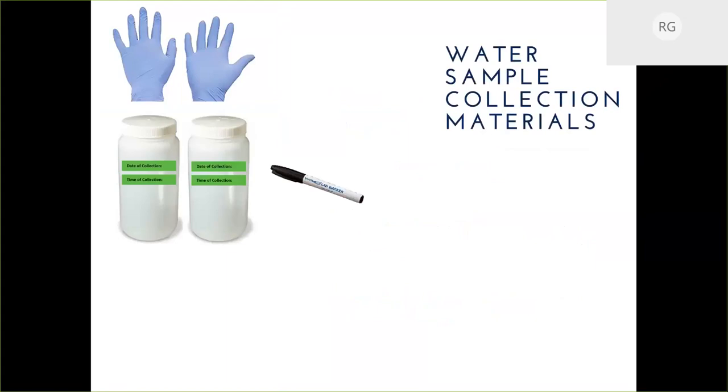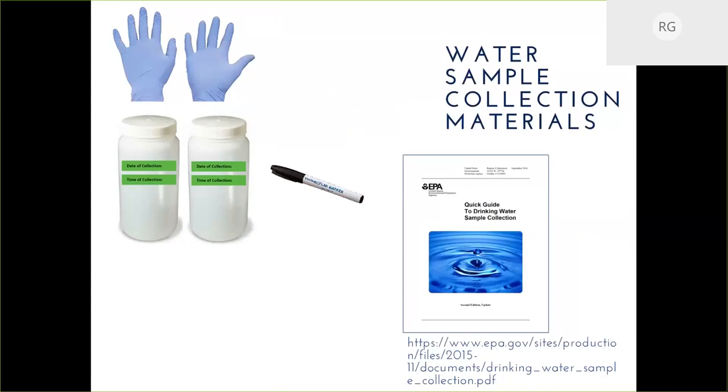It's really important to double check with the lab you're sending your samples to, or use this EPA quick guide to drinking water sample collection, to determine exactly the type of bottle that you would need for the type of contaminant you're testing. For bacteria, you can use plastic, but for some types of chemicals, you need to use glass bottles.